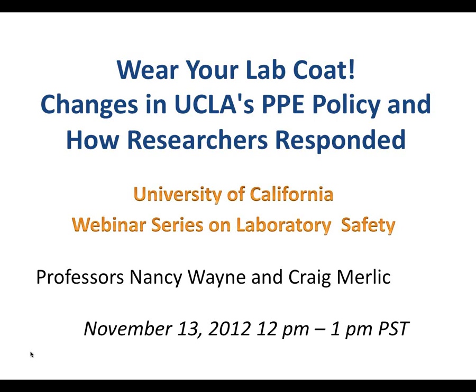Another question here is, do you have a policy that covers maintenance, facility, or custodial workers who enter laboratories? Yeah, that's an important point. So we sort of agonized about that because the custodians are coming into all the labs. What we have done is we have not required them to wear PPE of the type that the researchers are wearing, because they actually are not working with the laboratory materials. They're generally passing through, sweeping or collecting the refuse. Right. That's very different than anybody at all, including custodial workers and first responders, that would come into a BSL-3 facility. They are trained by the director of high containment facilities.